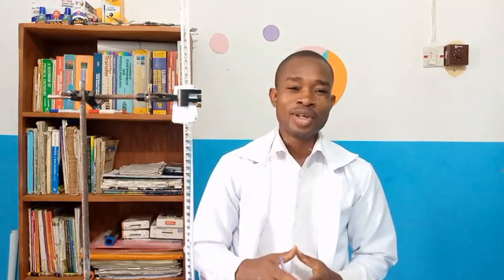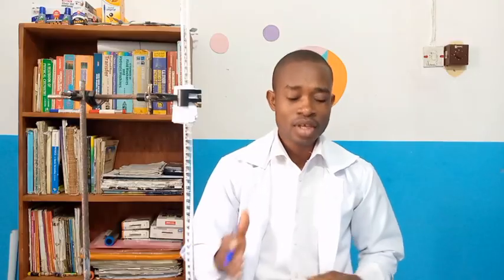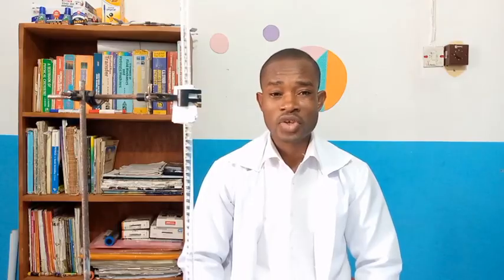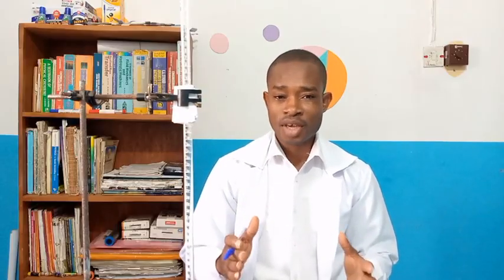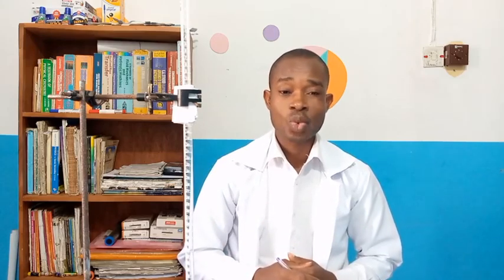And then you will be asked to copy and complete the table. So I would like us to do something like that also, so that you get used to how to obtain values that are missing from the table. So please watch the screen as I display the table of values obtained from this redox titration experiment. Please watch.